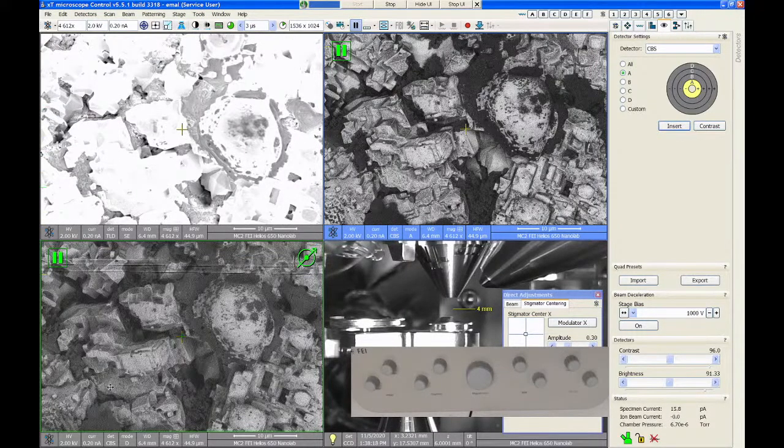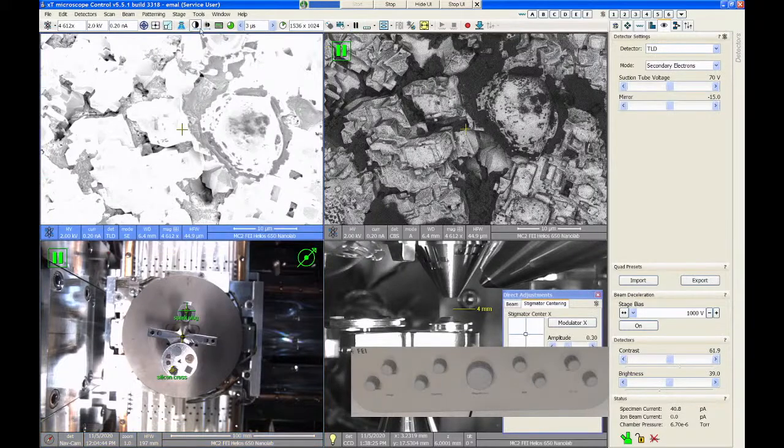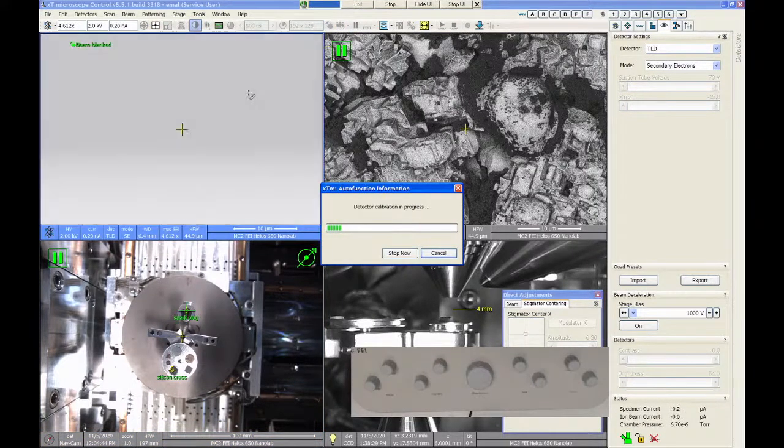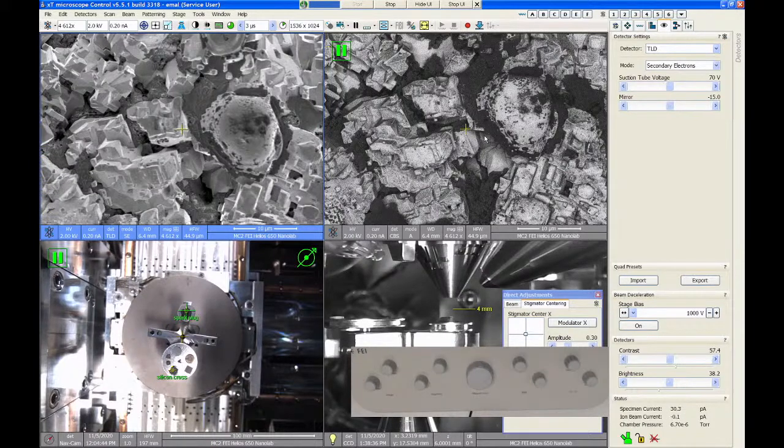Well, I've got a quick question. Is the backscattering camera kind of like the EDS, in terms of being able to look at different compositions of the samples? The backscatter detector image will be sensitive to the average atomic number of whatever you're looking at. Generally the contrast scales with the atomic number squared. There are calculations, and all kinds of ways to try to simulate this. But in general, high atomic number regions will appear brighter than low atomic number regions. It doesn't necessarily tell you the composition, but it tells you the relative atomic weights.